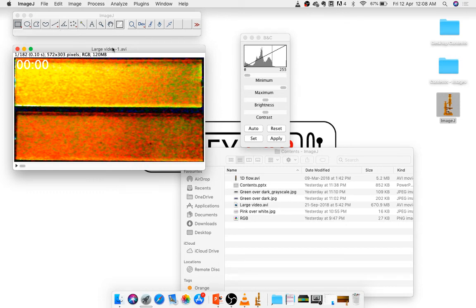Okay, I have this now. Now I want to export this as an AVI, so I can put this in a PowerPoint file. So here, notice I have 182 frames. Now, if I export it as an AVI of 1 frame per second, it will make a video that's 182 seconds. That's really boring, right? You don't want that. Typically, when you make a presentation, you want videos that last 5 seconds to 10 seconds.